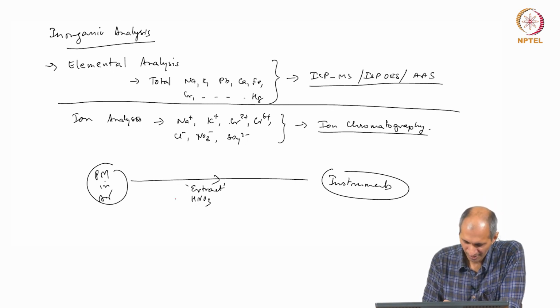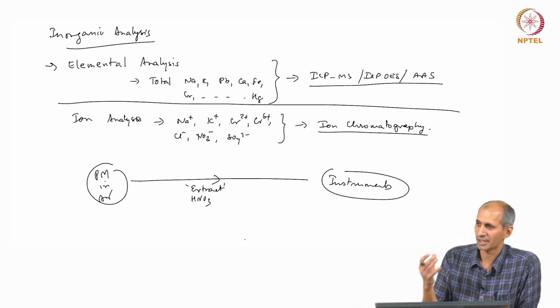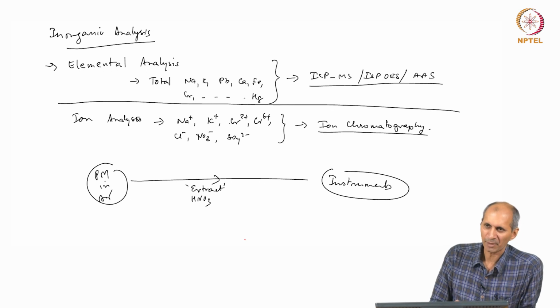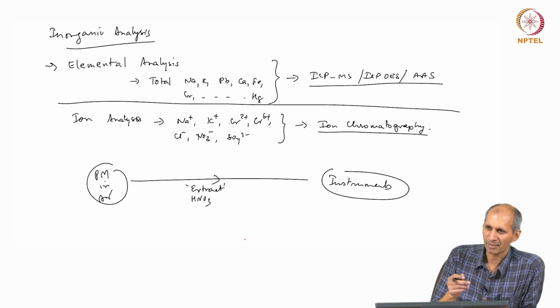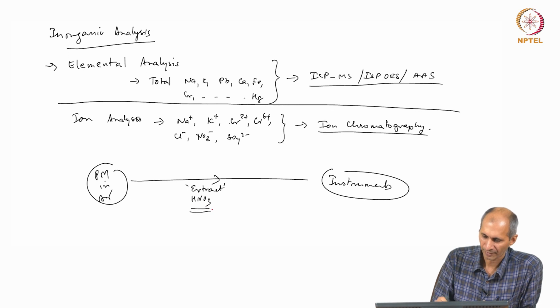Okay, so for extraction of metals from soil and sediment, which is a very dense matrix with a lot of material, we use concentrated HNO3. But the filter paper has only a few micrograms of material. You do not need to use concentrated HNO3. The amount of metals here is very small, and it is a very mild process. So, we generally do not use concentrated HNO3. You can use dilute HNO3, 10%, 20%. The specification is given. So, it is extracted and separated so that the acid extract is taken away.